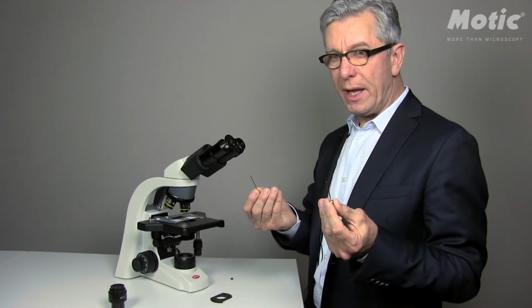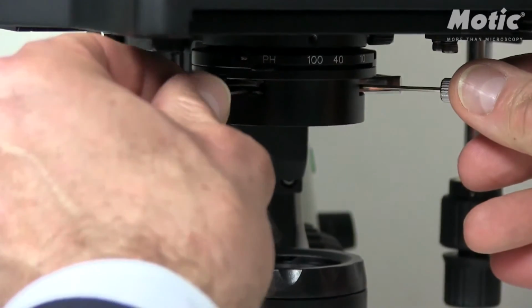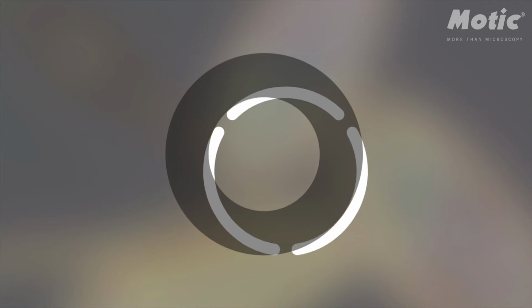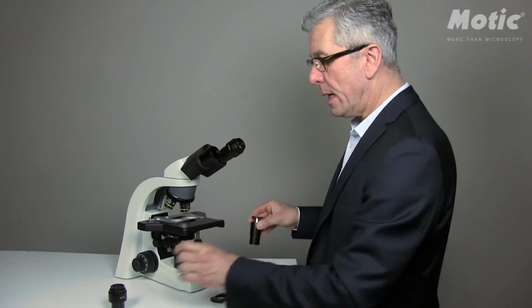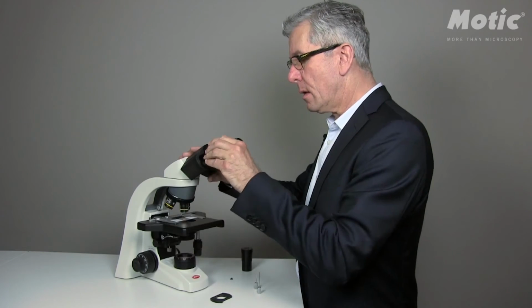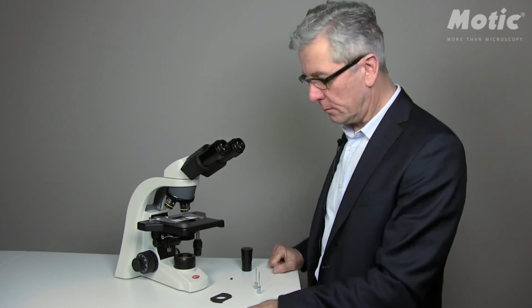So now you have to take the Allen keys, which will help you to move the illumination ring inside the condenser slider. Please find the countersunk screws to move this illumination ring until both rings are superposed together. Once you have done this, please remove the centering telescope, and again push in the standard eyepiece. Now phase contrast for our 10 times objective is adjusted perfectly.